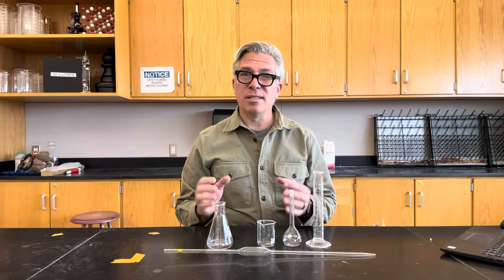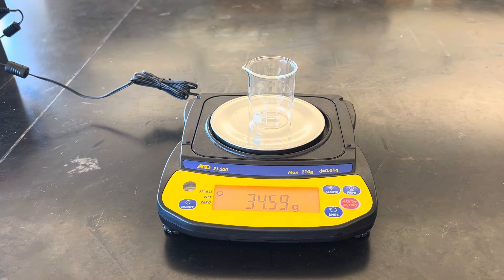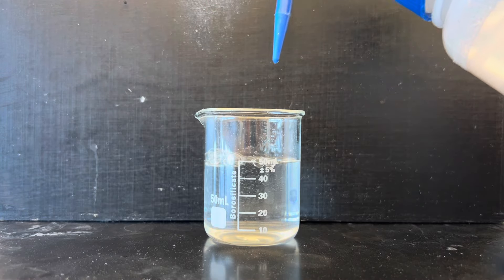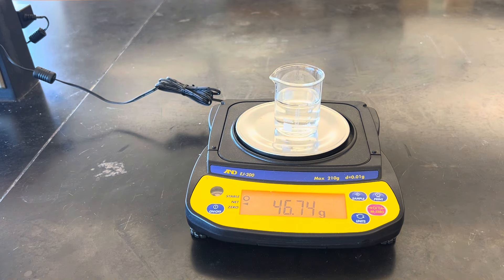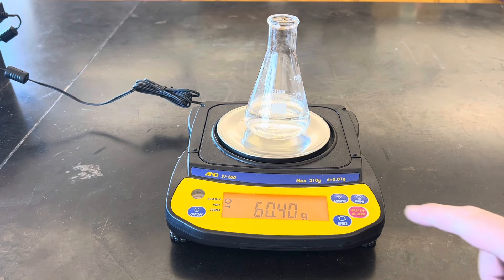Since the density of water is ridiculously close to one gram per milliliter, the mass of each water sample should be very close to 50 grams. I do this first by weighing the piece of glassware empty and then taring the balance so it returns to zero. Then I take water, fill it up as carefully as I can to the 50 milliliter mark, and weigh it again. The number on the scale is the mass of water directly because the balance already subtracted the weight of the glassware. Each of these should give a mass of 50 grams — but did they?